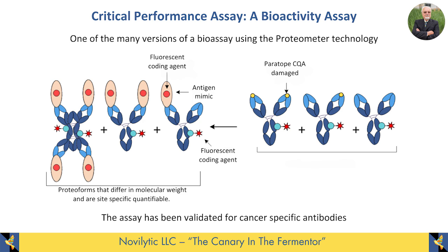And it turns out the really incredible thing is that you can do this in 3 or 4 minutes. So you can know in 3 or 4 minutes whether the antibody is actually functional. And why is that important? Well, we learned in the COVID vaccine era that the public was very concerned about whether the molecule that they were injecting into them was efficacious. Did it work? Was it any good? And this kind of an assay can determine that in 3 or 4 minutes.